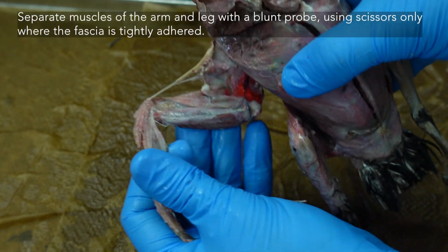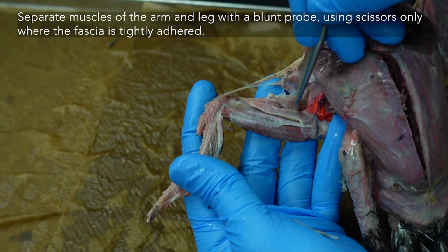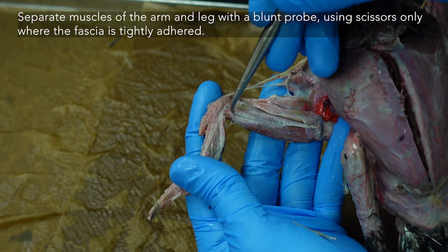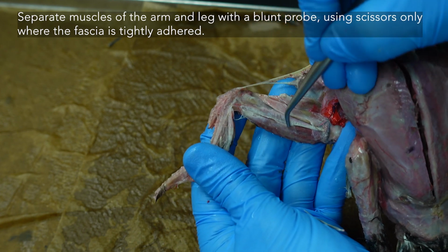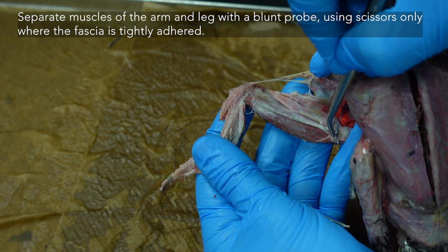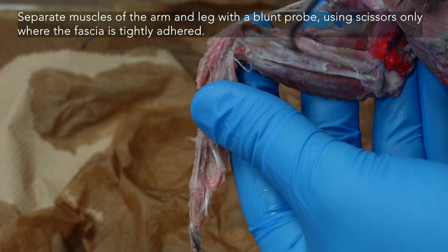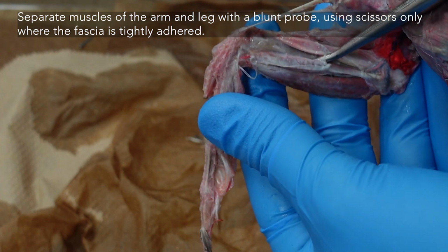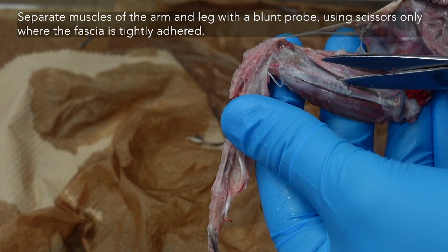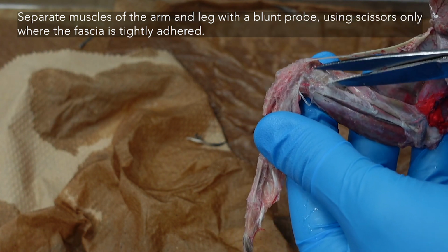In the arm, we have a few muscles to look at, and they're not going to involve a lot of deep down dissection. You're pretty much just separating fascia. We'll go over these muscles in the walkthrough, but just take your blunt probe and separate these muscles from their origin to their insertion, or at least close to the insertion, so you can get a blunt probe underneath. If it does feel like the fascia is holding on pretty tightly and you don't want to risk the muscle, you can use your scissors and gently, gently just cut alongside that muscle. I wouldn't even close the scissors, just use your scissors as a lifting tool to lift that fascia away from the muscles.